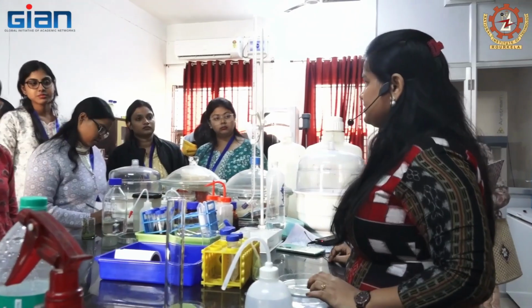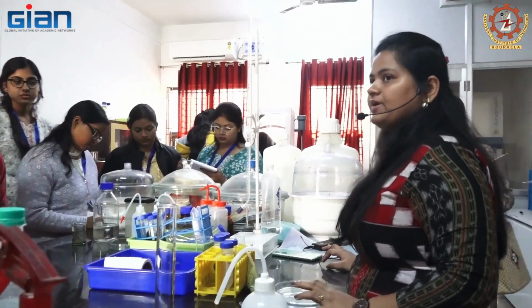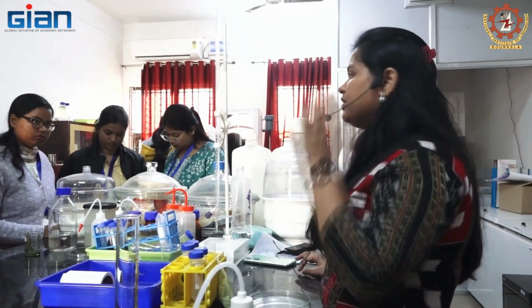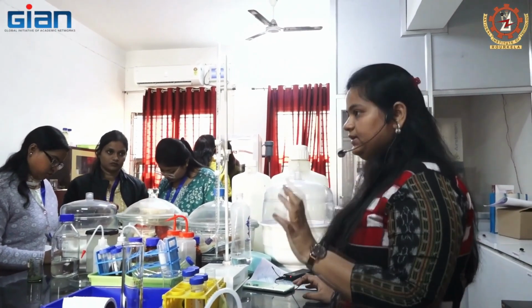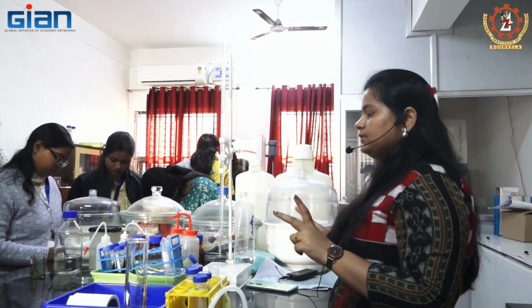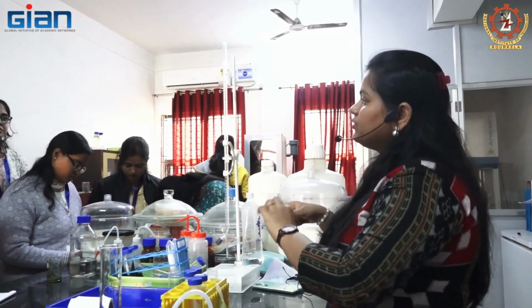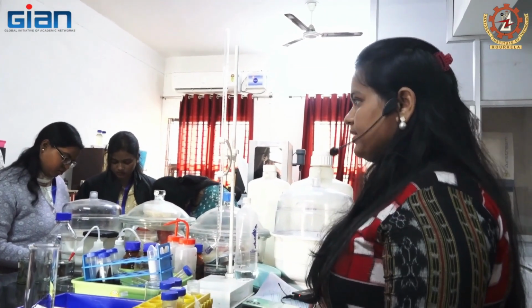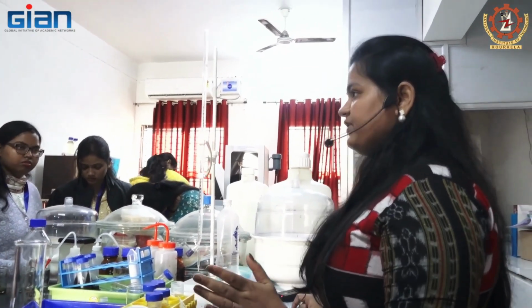The microwave assisted extraction also has an external force, which is microwave. Microwave is an electromagnetic field which is given to the food samples to extract the bioactive compounds similarly. But here the mechanism is different.